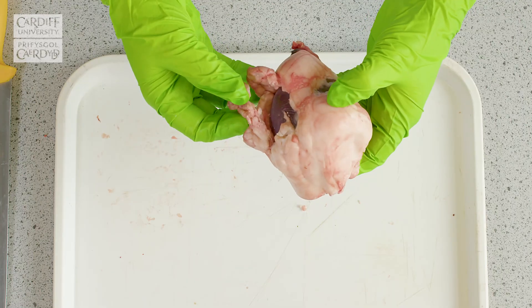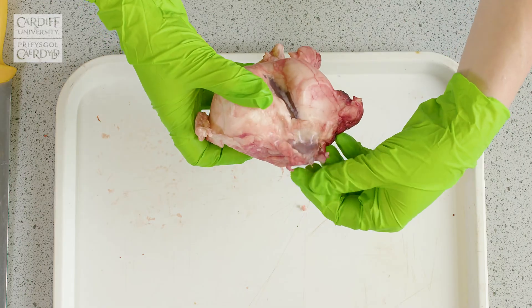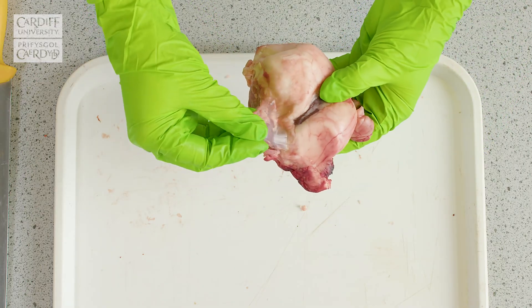So when you pick up the kidney, try and orientate it so that you know where the hilum is. In this case, the hilum is located within this tissue here.